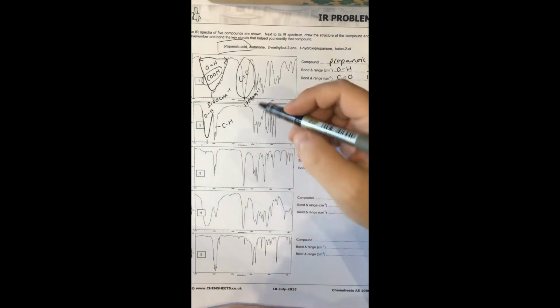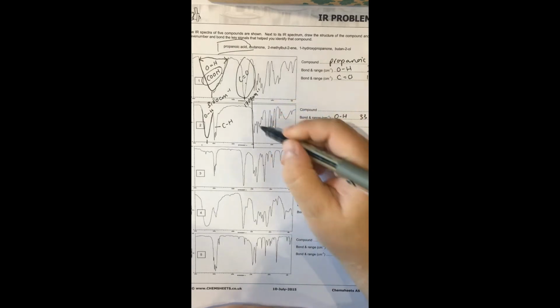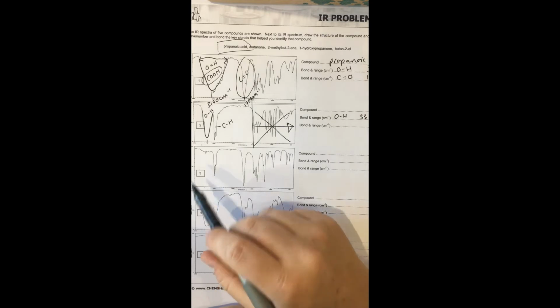And then we haven't really got anything else that's interesting, because remember, that's the fingerprint region and we don't care. So we're looking for a molecule that's just got an alcohol and nothing else of interest. So that gives us butan-2-ol.